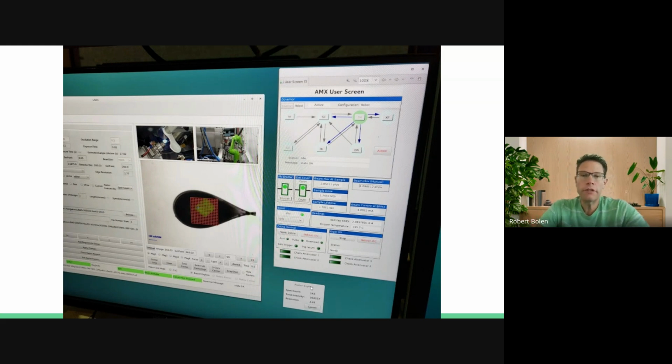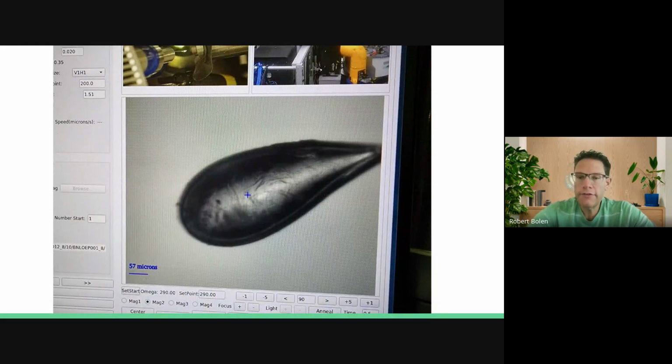So the computers really do help us a lot, and they give us some suggestions as to where we can find potentially really good diffraction data. And so these are some really small crystals that are in one of the loops, and the little plus sign here indicates the precise point where the beam is going to hit. So what we do is we align the crystals so that they are right underneath that plus sign, so we know that we're precisely hitting the crystal the way we need to.